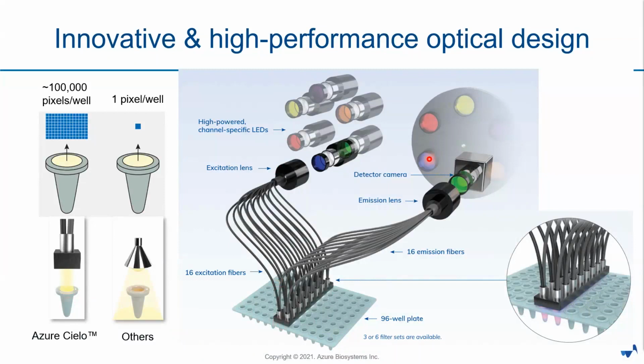These 2x8 fiber optics ensure that all the specific wells across the entire qPCR plate are evenly illuminated. So even illumination, and you do not have excessive light shining outside the well. Therefore, the background signals will be minimized, and you won't mask the fluorescent signals coming from the reaction itself.